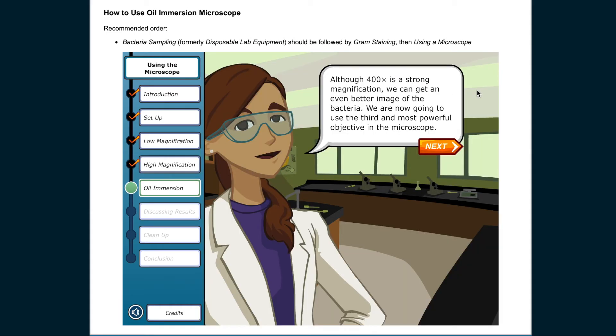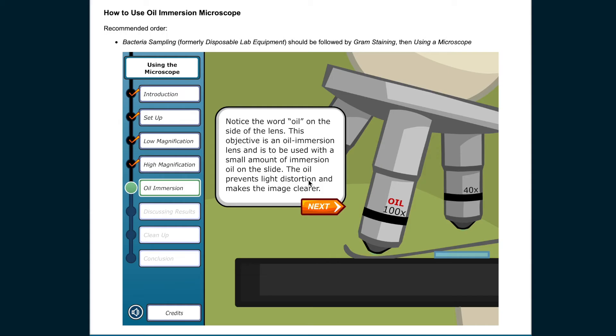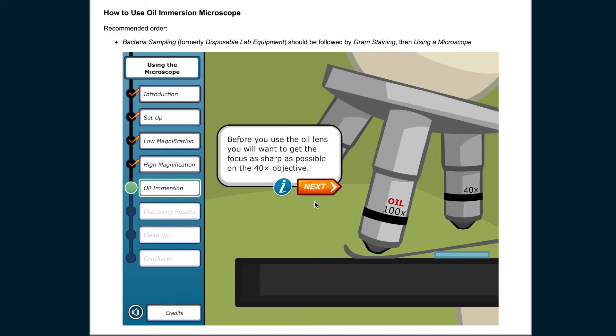Although 400 times is a strong magnification, we can get an even better image of the bacteria. We are now going to use the third and most powerful objective in the microscope. This objective has 100 times magnification, which will give us a total of 1,000 times magnification. Notice the word oil on the side of the lens. This objective is an oil immersion lens and is to be used with a small amount of immersion oil on the slide. The oil prevents light distortion and makes the image clearer. Before you use the oil lens, get the focus as sharp as possible on the 40 times objective.